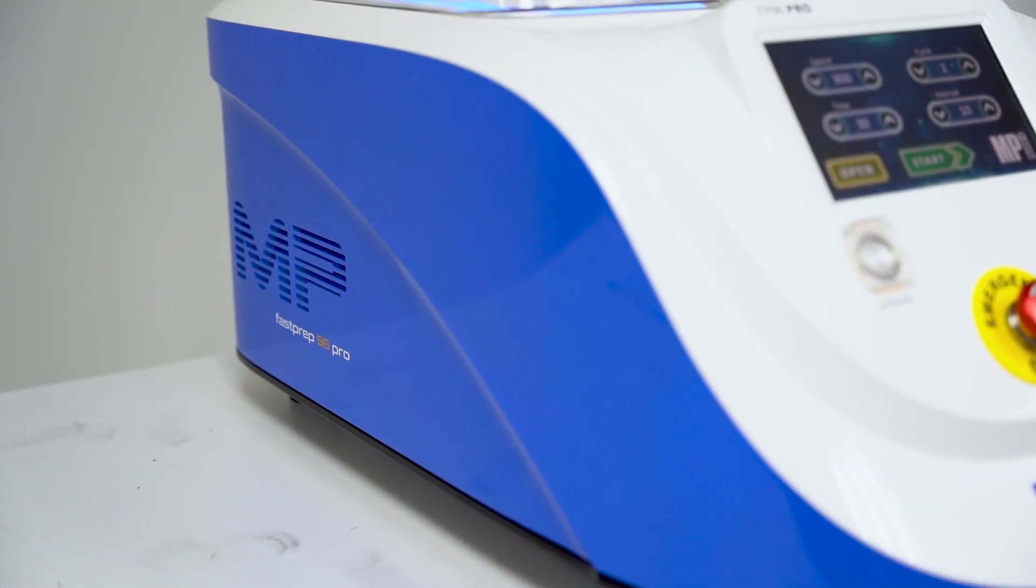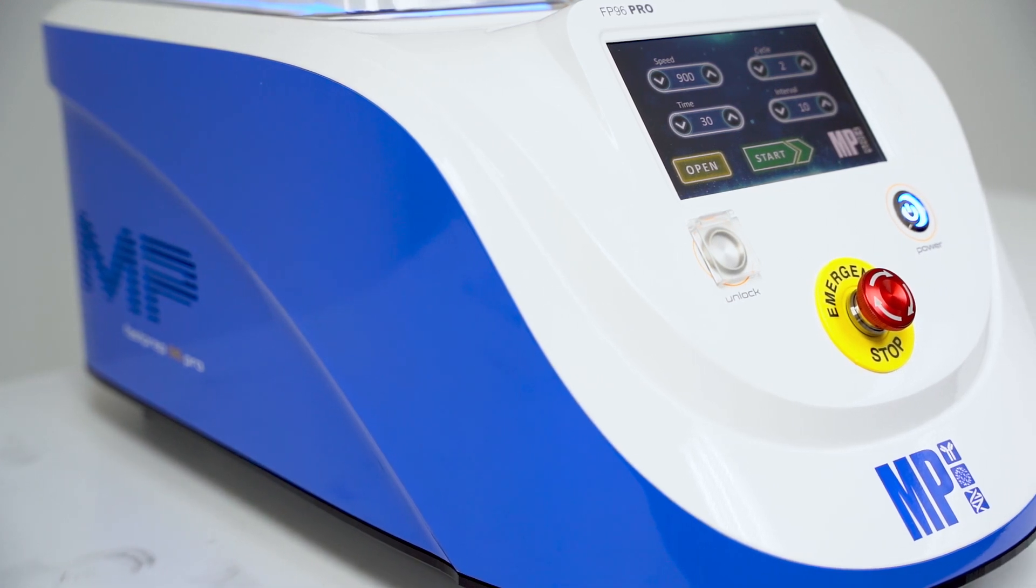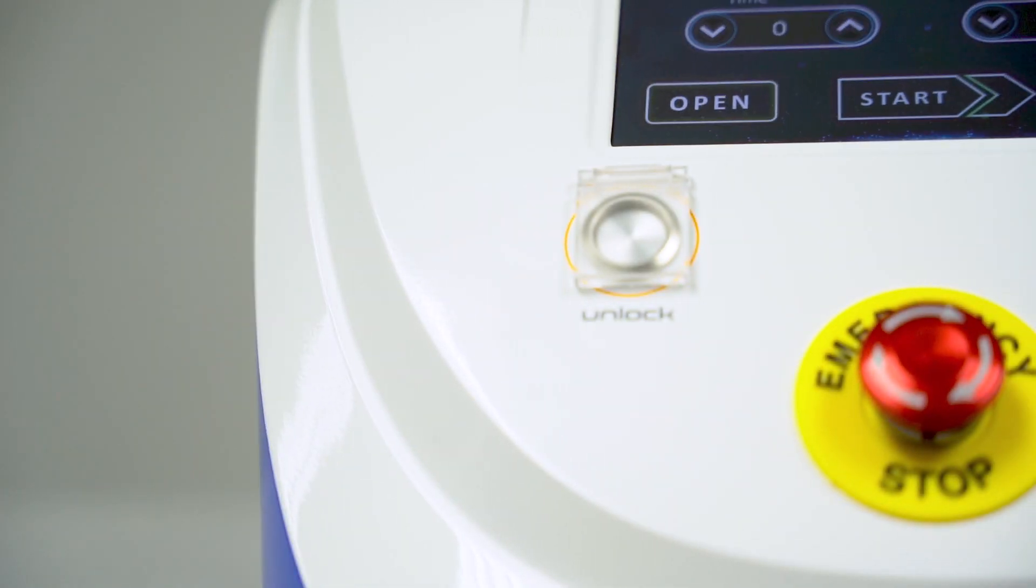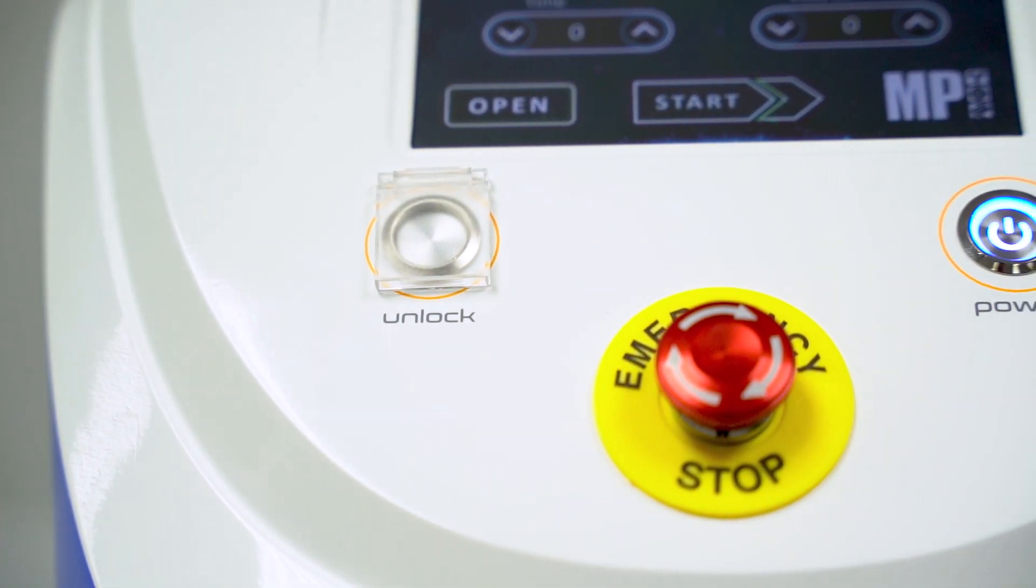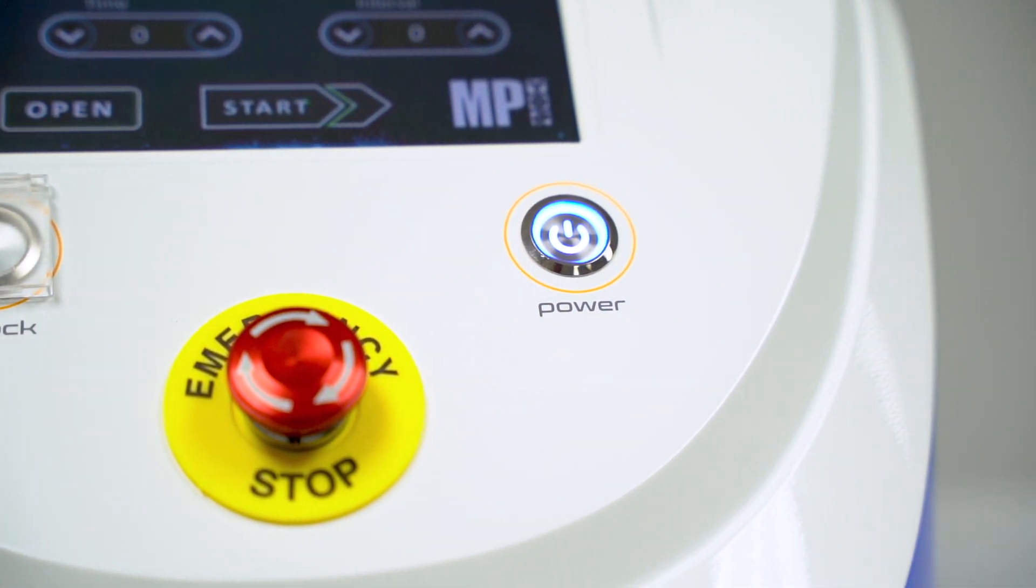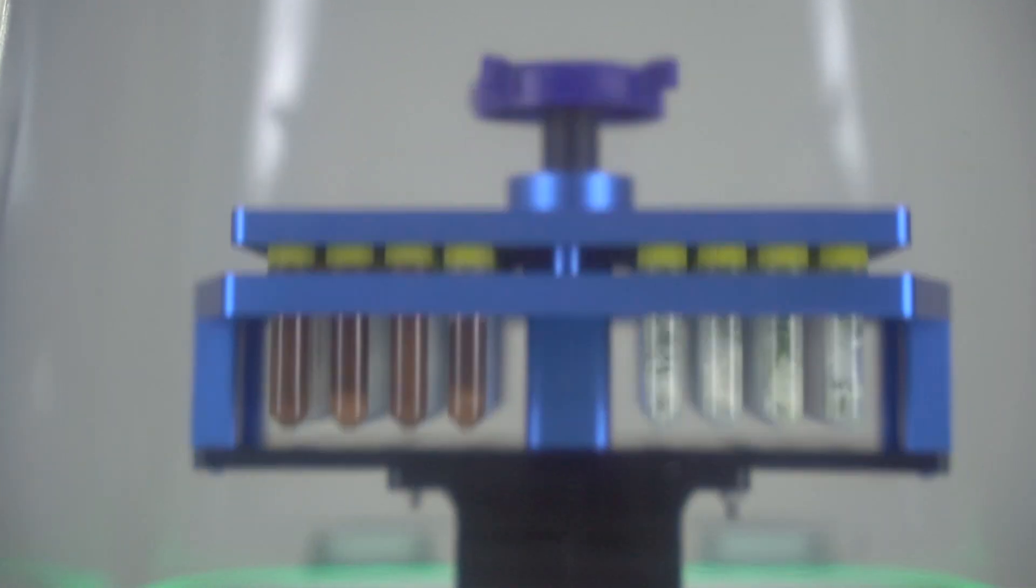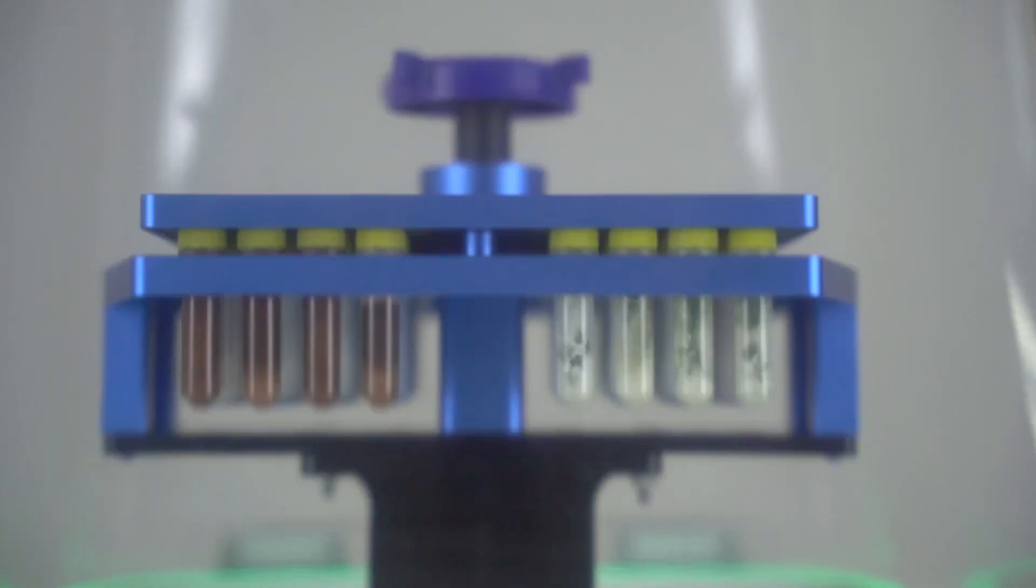Meet the FastPrep 96 PRO, the ultimate high-throughput homogenizer for research sample preparation. With its unique linear motion, the FastPrep 96 PRO can thoroughly homogenize a wide range of sample types in seconds, preserving the integrity of nucleic acids, proteins, and metabolites. When paired with specialized lysing matrix beads, this machine ensures high yields and reliable results.